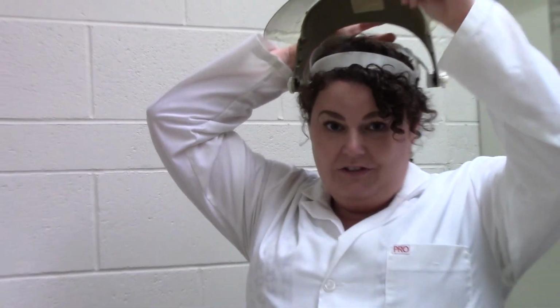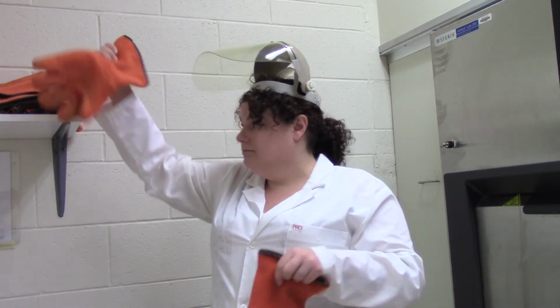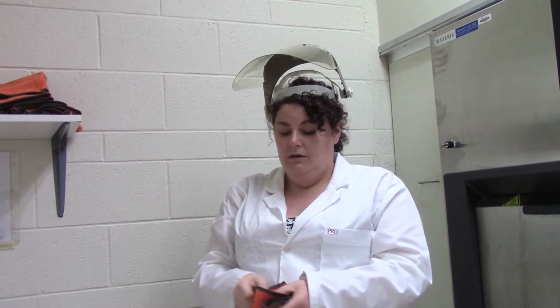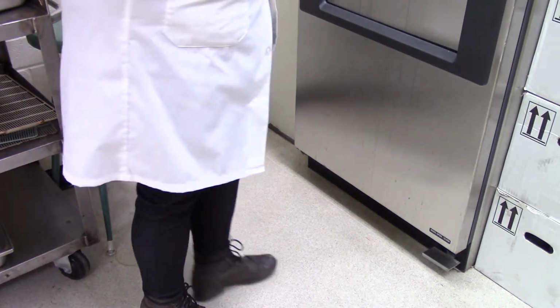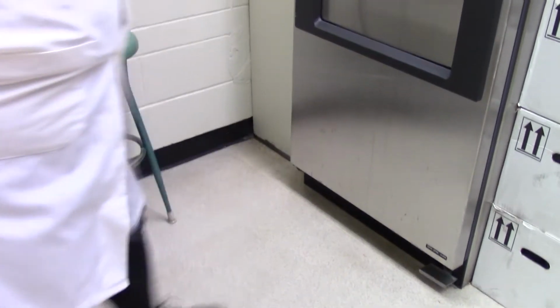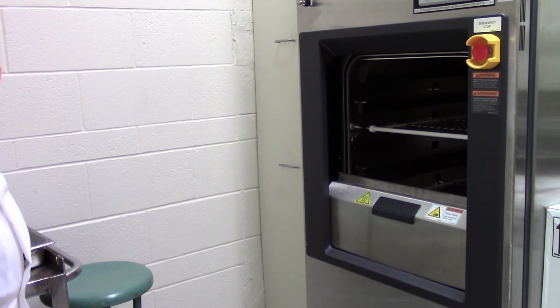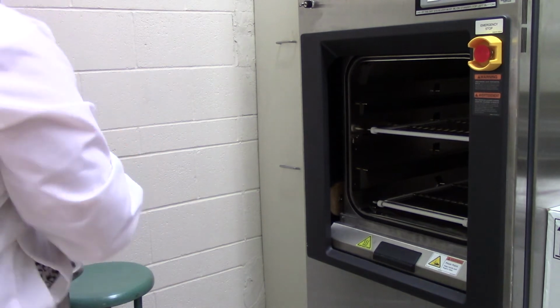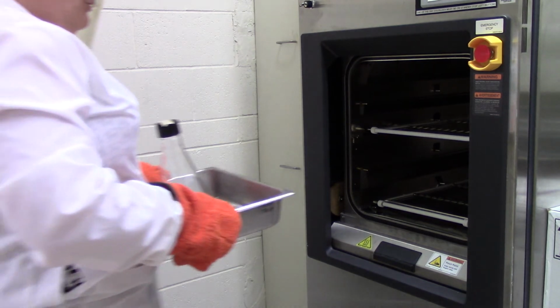All right, lift this up so you can still hear me. So I'm going to also grab my heat-resistant gloves. And to actually open the autoclave, there is a foot pedal down below. So what I'm going to do, I've got my shield down, touch my foot pedal, and step back and let the autoclave open. Now that it's open, I'll load in my materials.